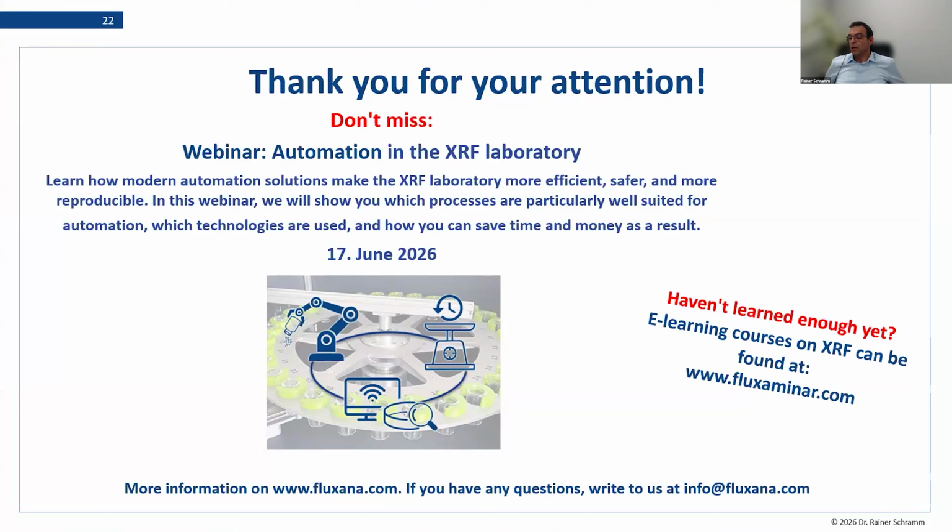So this helps us in the end to just ignore these effects in the calibration and evaluation, and makes it also very robust. And this is the trick how we go around this LOI and GOI effect.